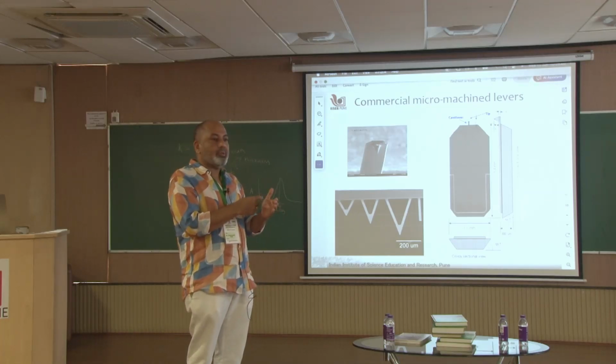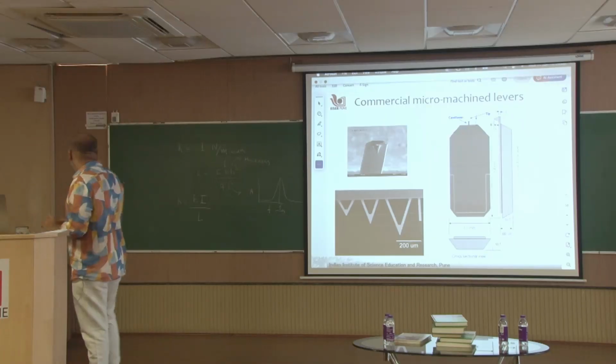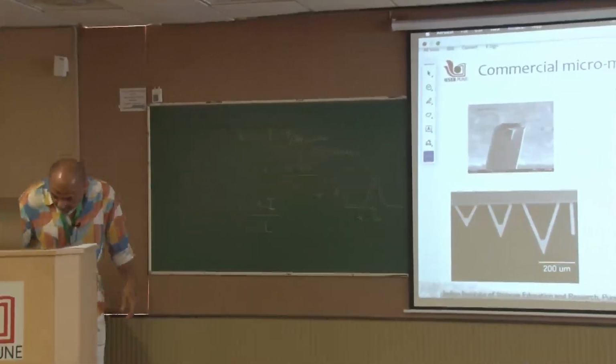But typically what people quote is the tip radius.